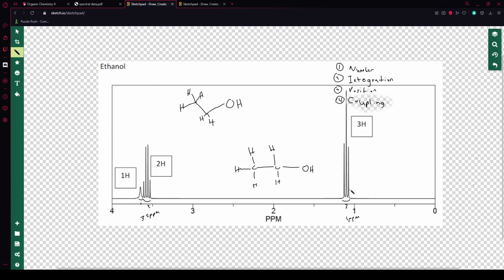But basically what I'm saying is that these hydrogens, so this one and this one, are represented in the coupling of this hydrogen's NMR or this hydrogen's NMR, right? And so we can see that this series here has 3 peaks, and we're going to say the first peak is just to know something's there.